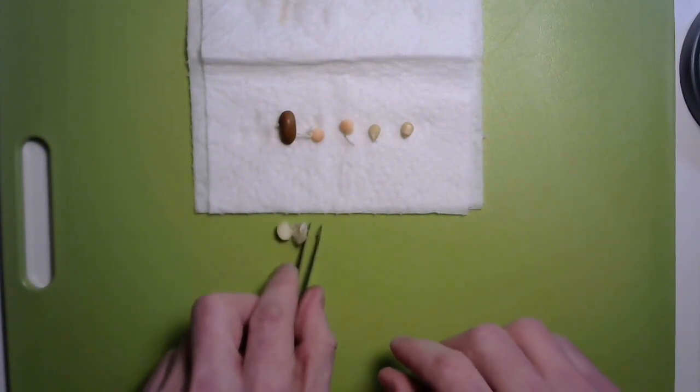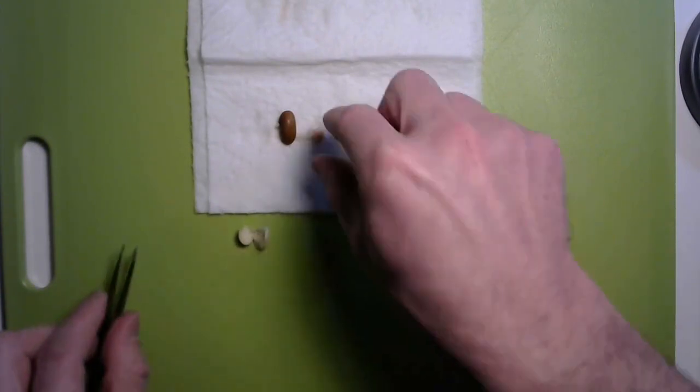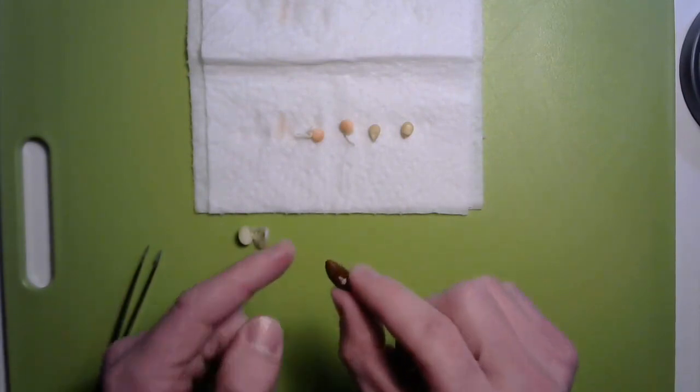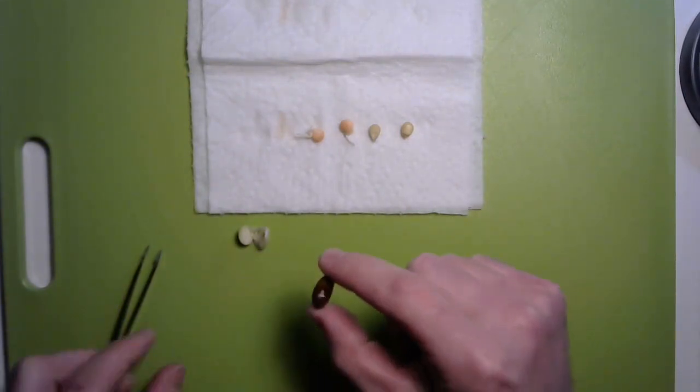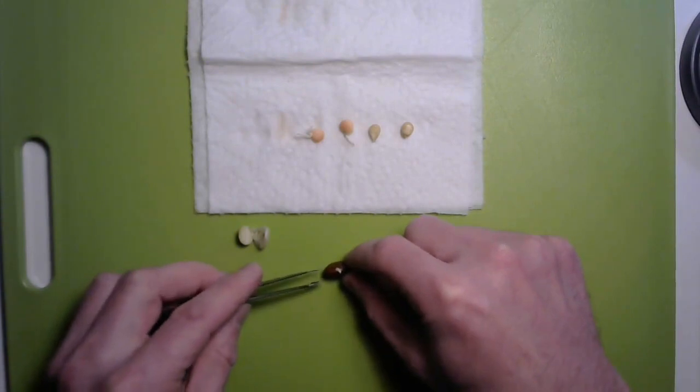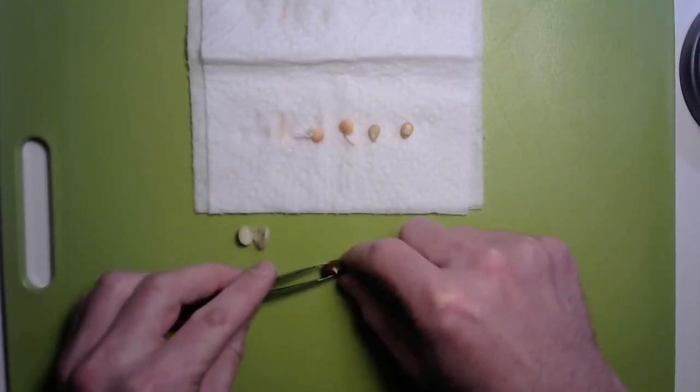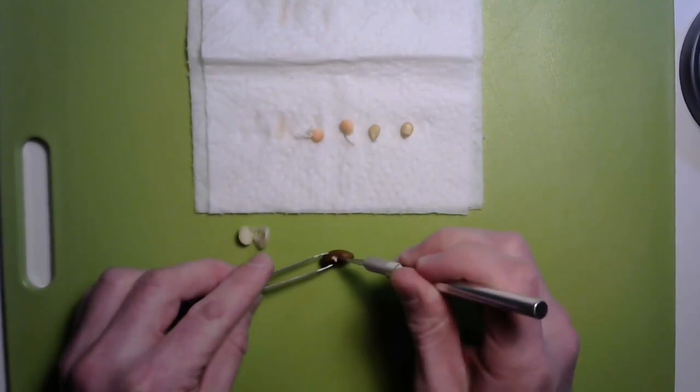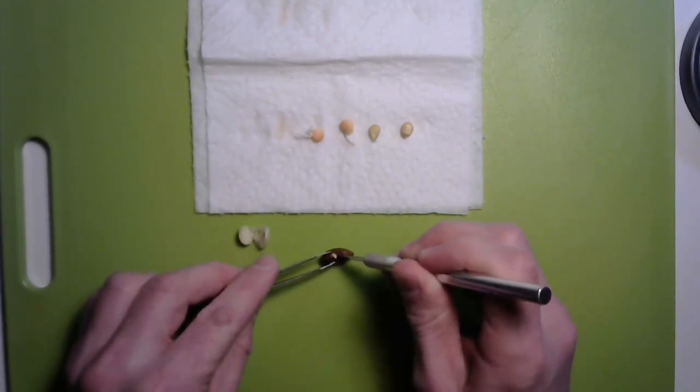I'm going to move this one off to the side and grab my next one. This one's a bean, and the same thing. I'm going to look for that area where it's sort of divided and I'm going to cut along that. Use my tweezers to hold it nice and steady. And there we go.